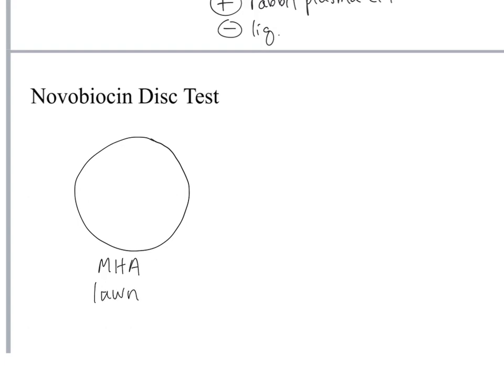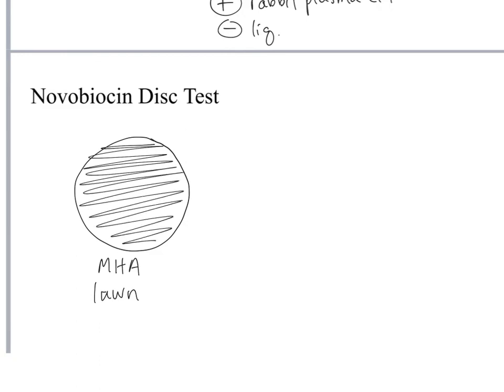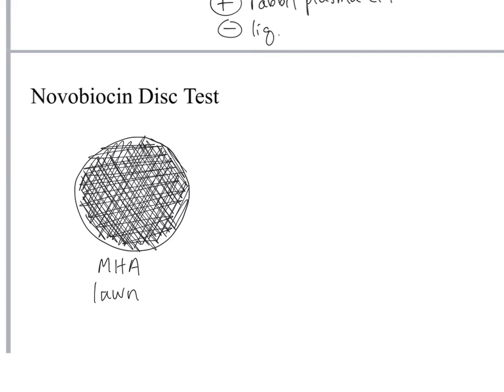So remember, if you're using a swab, do that 3 different directions. If you're using a loop instead, which probably you are, since our organisms will be on solid media today, maybe you want to go 5 different directions just to make sure you get nice, even, confluent growth on there. Okay, you got the idea there.